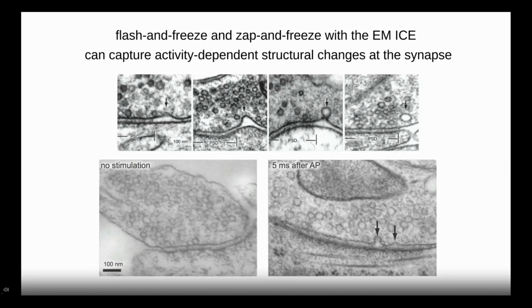And the wonderful thing is you never know what you'll see under an electron microscope. I haven't talked at all about the postsynapse. There's lots of things you can capture there. You really never know what you're going to see, and you really will wait to see what you can get at this beautiful amount of resolution with this temporal component added.